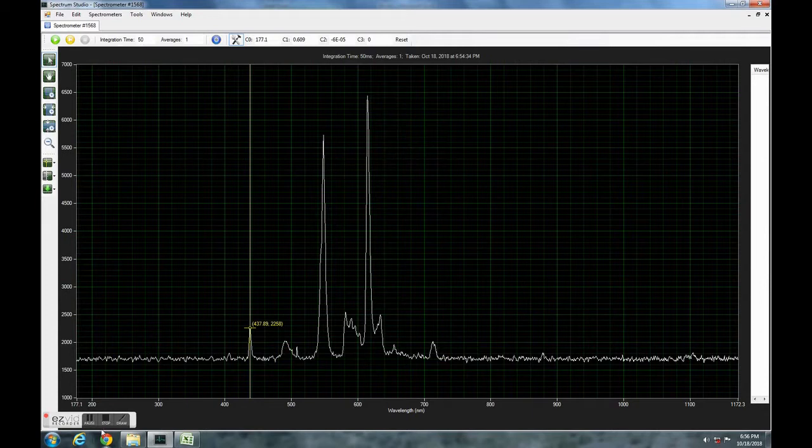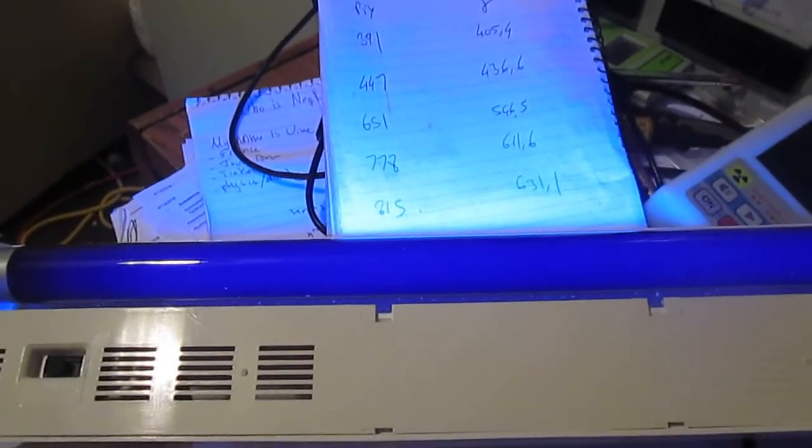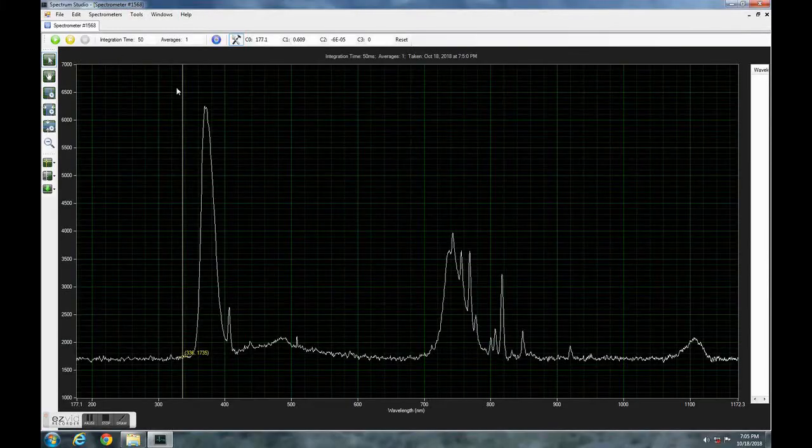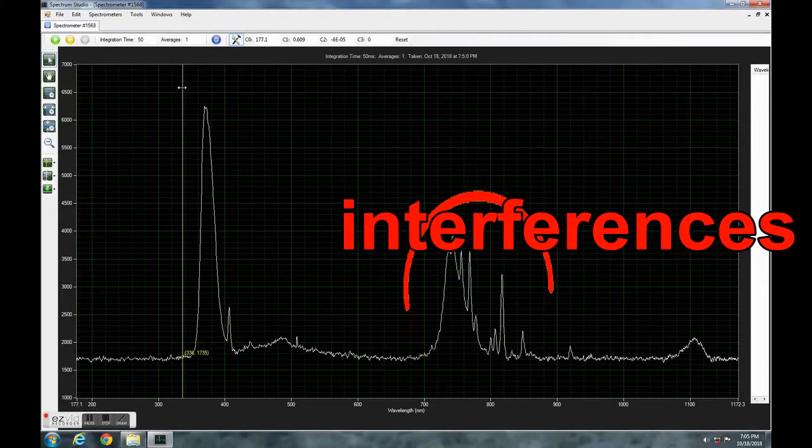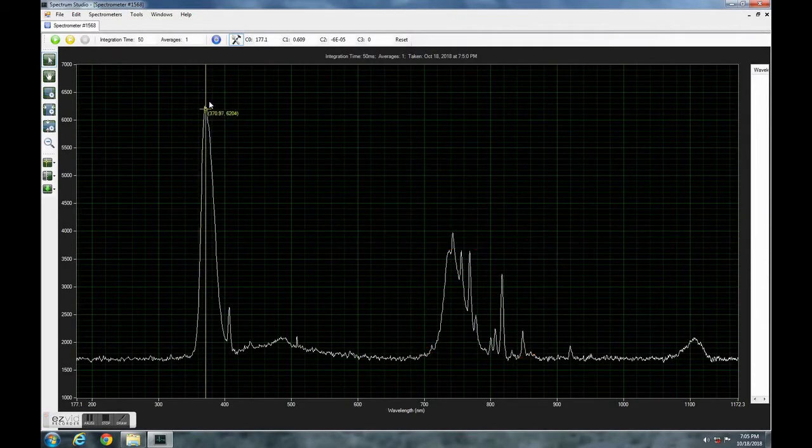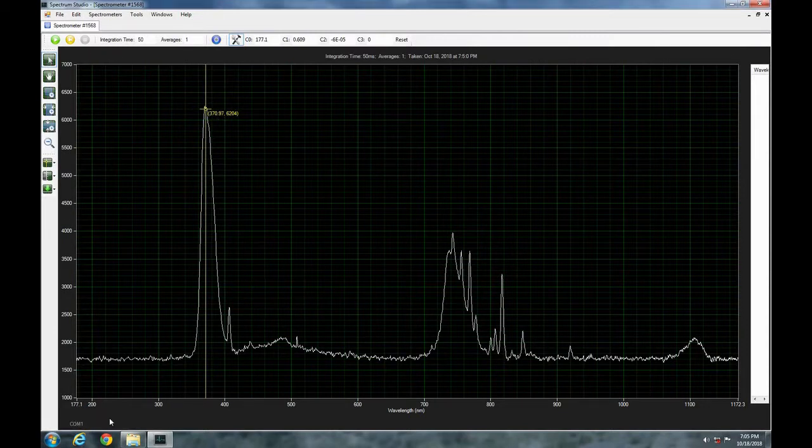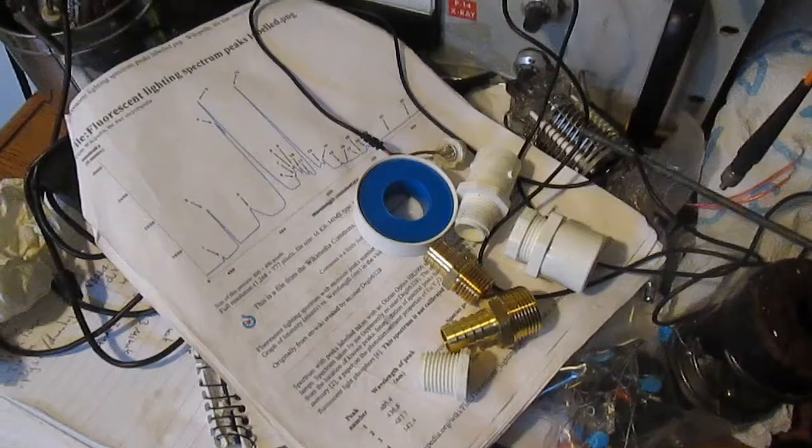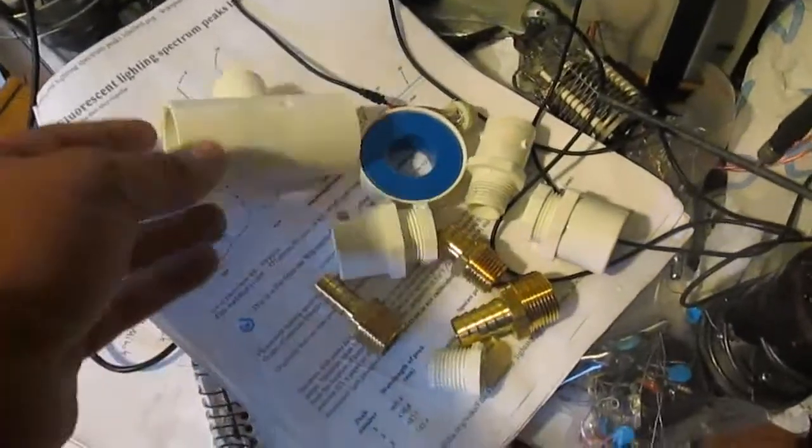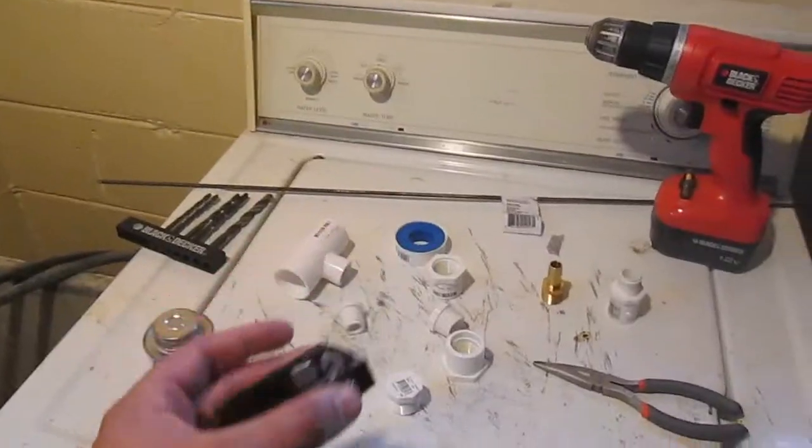So I tried to see the spectrum of a black light and sure enough the 370 nanometer main peak showed up, and even the tiny little one down here at 405 from mercury. So with that in mind I went to my local hardware store and purchased a few items, mostly PVC pipes.